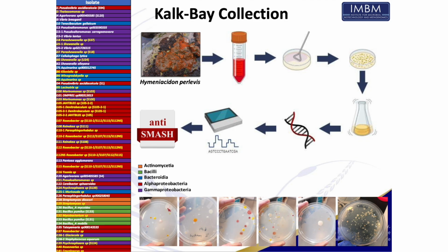This table on the left just shows you some of the bugs we've expanded on that we managed to isolate. If you're familiar with biology, we've obviously got genus and species names for different organisms. Here, for example, the genus name is JAHTBLO1, and we don't know the species.